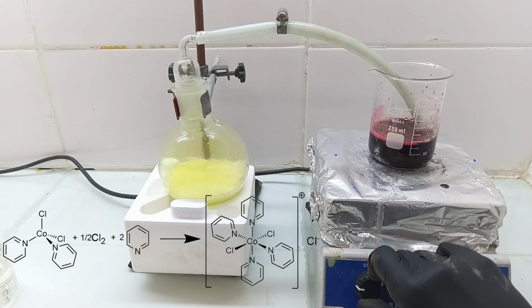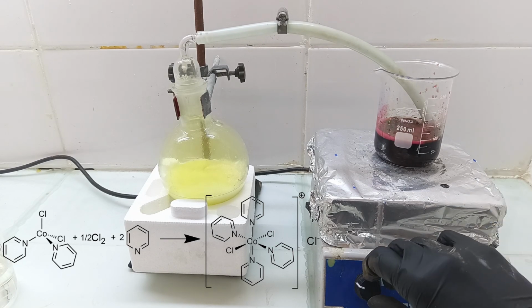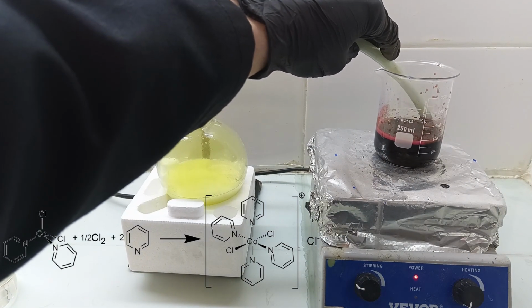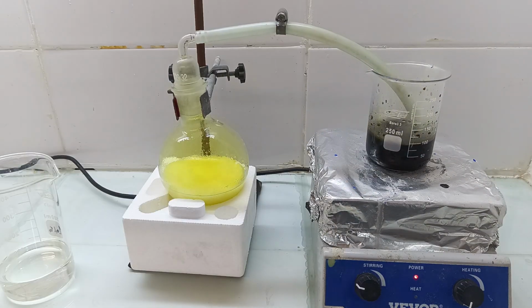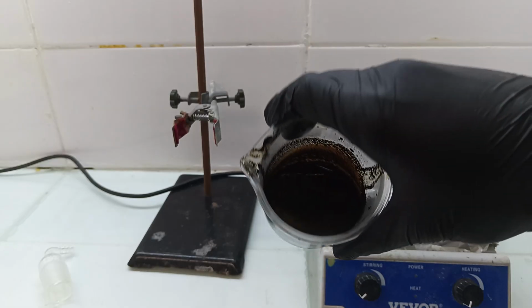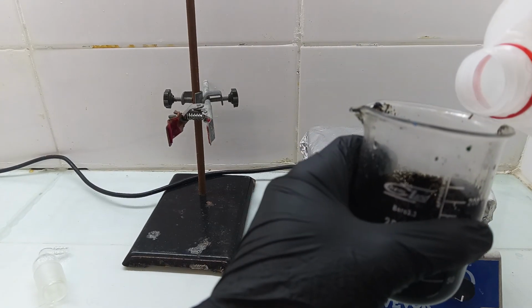As soon as the chlorine touches the solution, it turns a deep brown and then black. When I was first doing this preparation, I assumed some of the pyridine polymerized and formed tar, but as it turns out, in solution, the ion is a deep brown. I let the chlorine bubble through until I saw that no more of it reacted. After that, I dismantled the generator and let it stand for a bit.